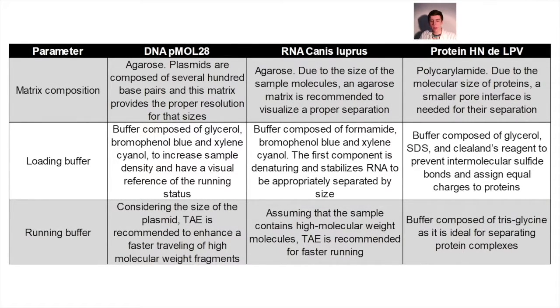Now we present the table of the different parameters that must be taken into consideration according to the type of sample that will be analyzed.